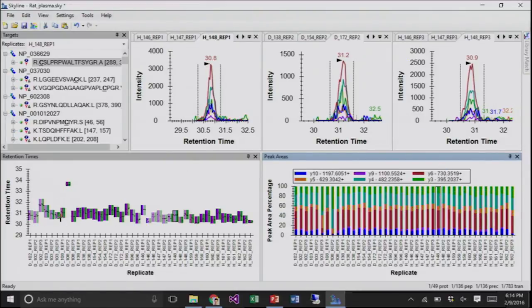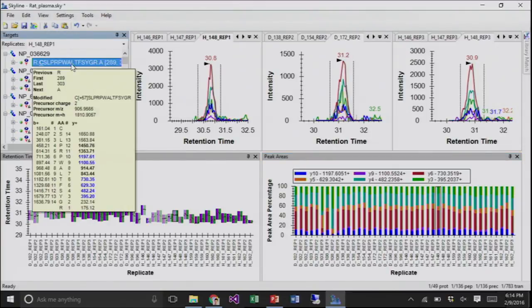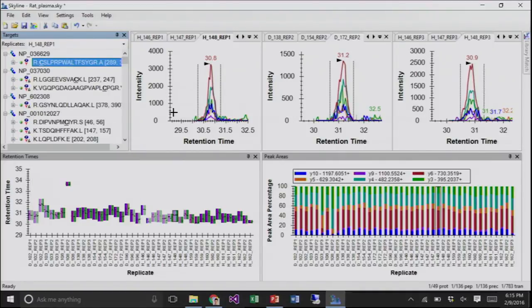All right, and so now this is the mode where I think you can actually progress through. Definitely, as Ludovic said, you would like to have the statistical tools that Ludovic was talking about, but that doesn't mean that you should ever give up looking at your data. Because I've seen many times where people get so focused at the statistical level that they forget that they have complete access to the data beneath, and there are actually problems in the data beneath. So always protect your ability to get in and look at things.